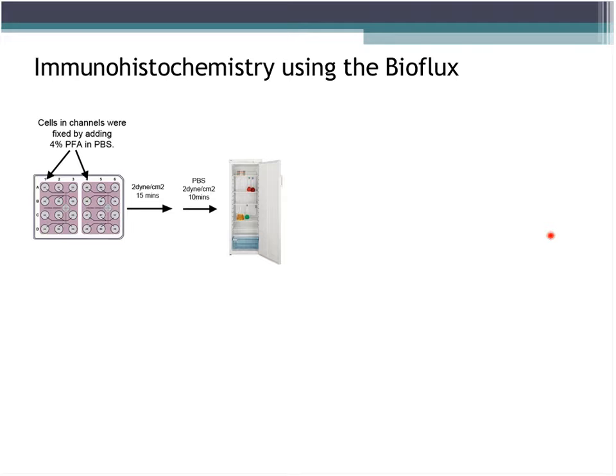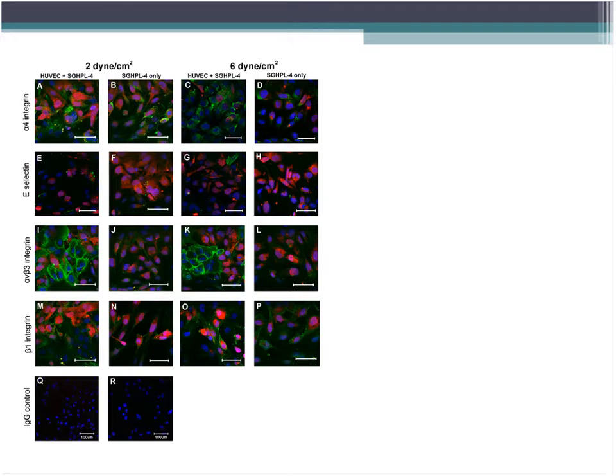Okay, so then we would examine these by confocal microscopy.